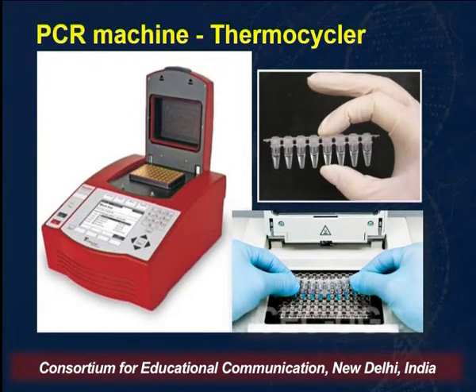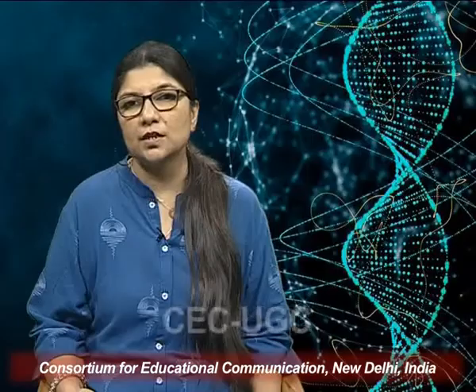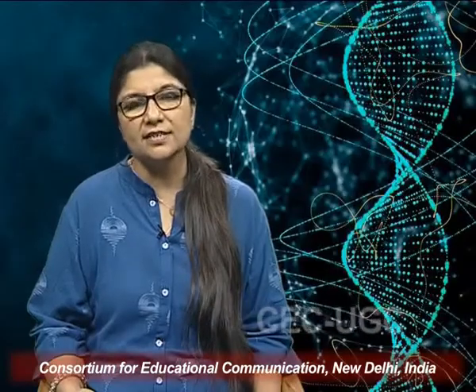Then the program is set where you involve 3 different steps, that is denaturation, annealing and extension, that will cause the product to be amplified. So we will discuss these 3 steps in our next session.